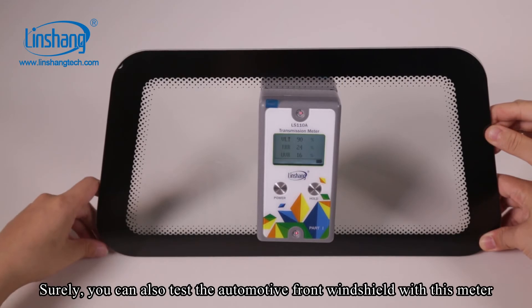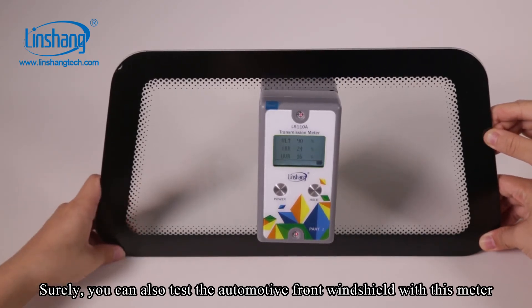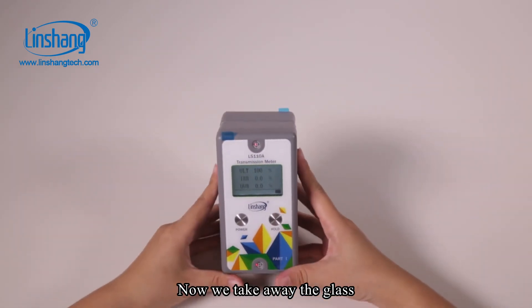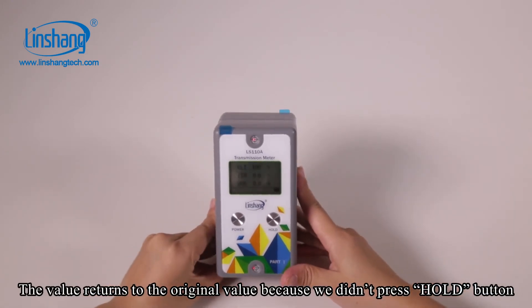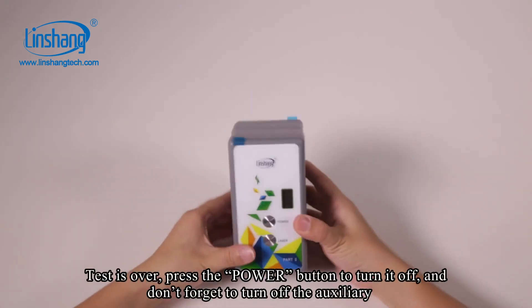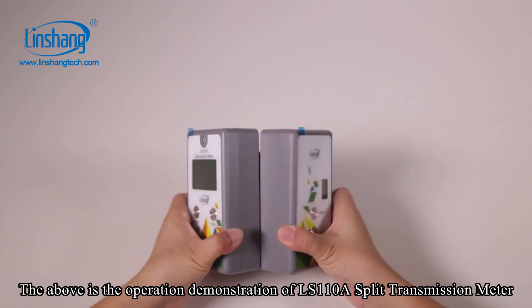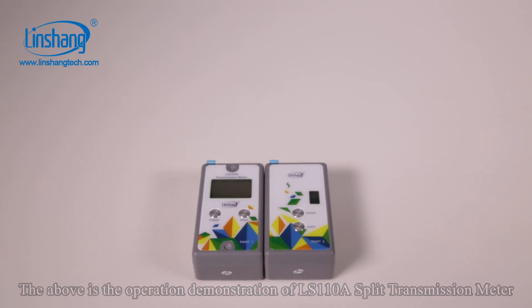You can also test an automotive front windshield with this meter. Now we take away the glass. The value returns to the original value because we didn't press the hold button. Test is over — press the power button, and don't forget to turn off the auxiliary machine. The above is the operation demonstration of the LS110A split transmission meter.